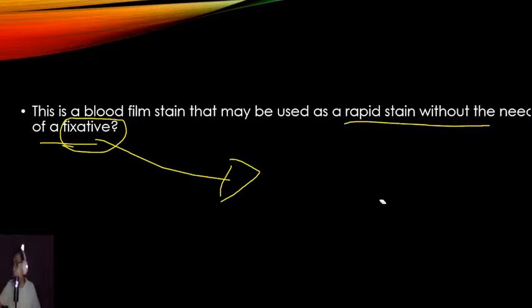Is Lindel here? Yes, sir. Alright, so what is your answer? What's the best fixative for blood and bone marrow aspirates? Methanol, po. Alright, good. Wonderful. Yay, I'm not disappointed, because you didn't say formalin. Alright, thank you so much.